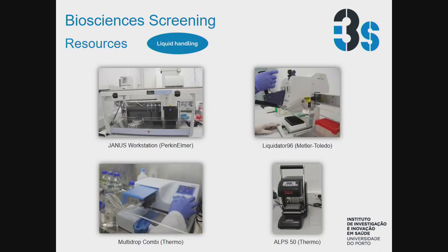In terms of resources for liquid handling, we have a liquid handling automated workstation, which we mainly use for compound management and compound transfer, but it can also be used to automate pipetting steps during your screening protocols. We also have a 96-head pipette head, which is just as if you have a manual pipette of 96 channels, which is extremely useful for medium throughput.